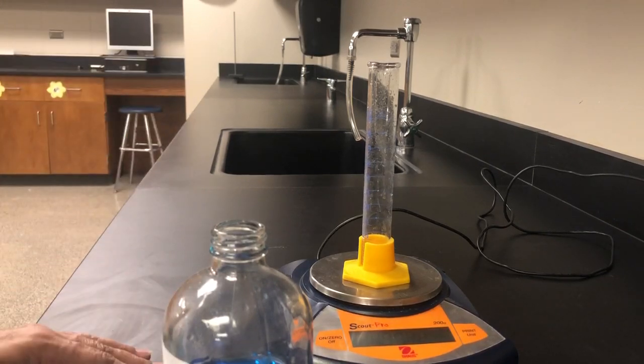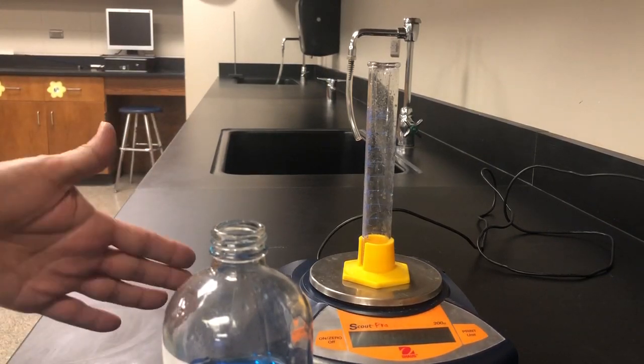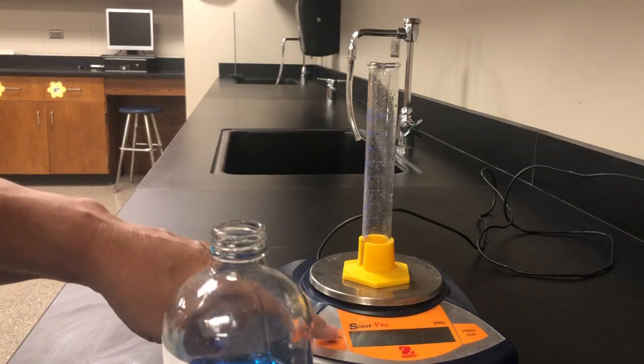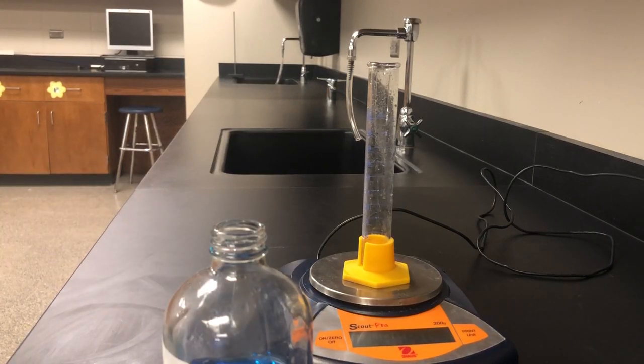Now over here on the electronic balance, I have a graduated cylinder that goes up to 50 milliliters and the graduations go by ones. I'm going to hit the tare button to zero it. So now it says 0.00 grams.